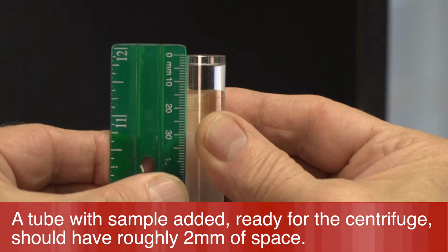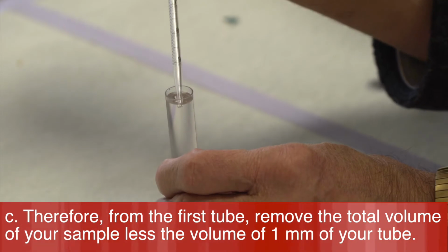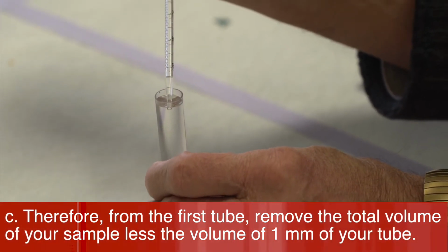A tube with sample added, ready for the centrifuge, should have roughly 2 millimeters of space. Less space and the gradient may spill. More space and the top of the tube may collapse. Therefore, from the first tube, remove the total volume of your sample less the volume of 1 millimeter of your tube.